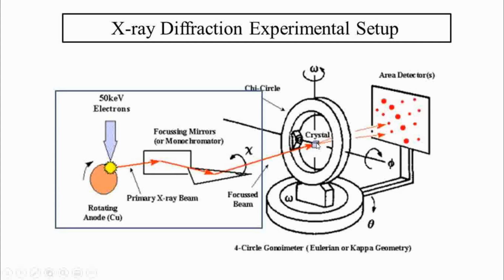In this crystal you have the X-ray beam, and opposite to the X-ray beam you have the detector, right? So they work hand in hand, and you see here this is a change in angle. Either you change the angle in this orientation or in this orientation, so that the crystal's angular change is there, and as you change the orientation, you study the pattern of X-ray diffractions which you are getting.